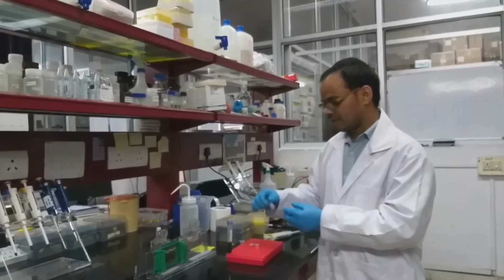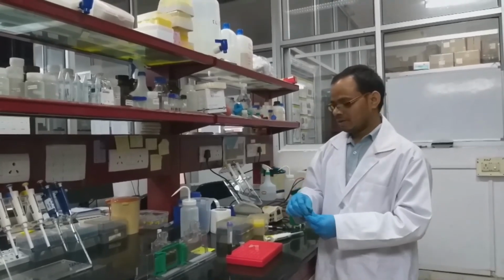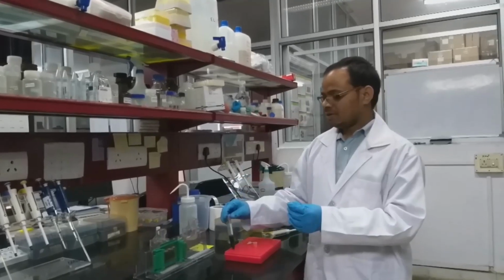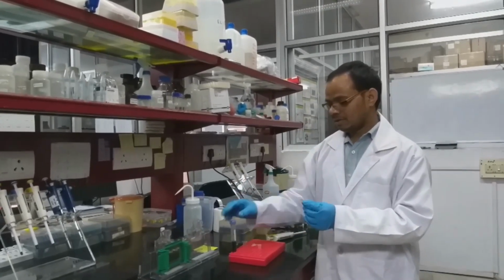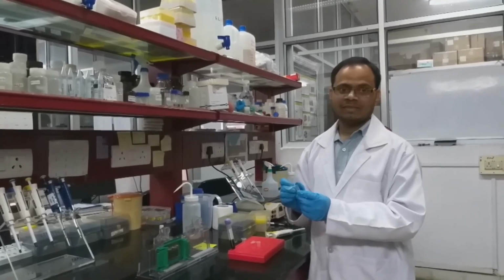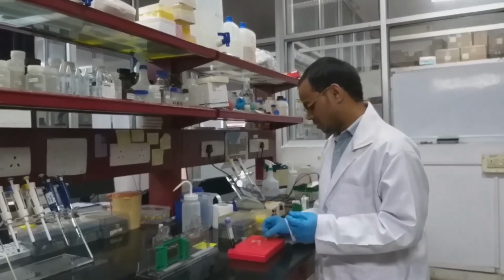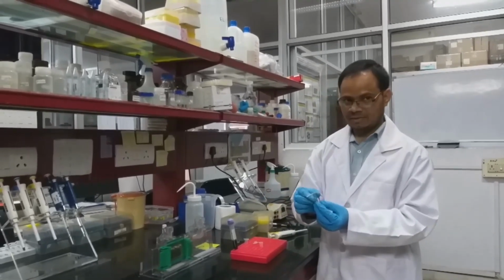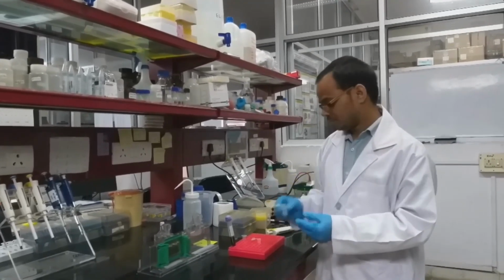So we have to take the protein solution. Here we already prepared 10x loading dye. We have to prepare 1x to mix with the protein solution. So this is 100 microliter of protein solution.